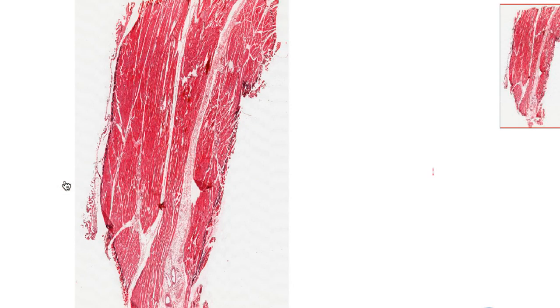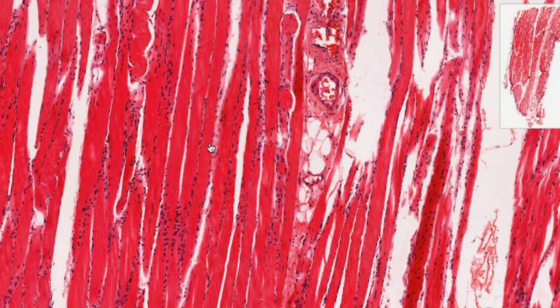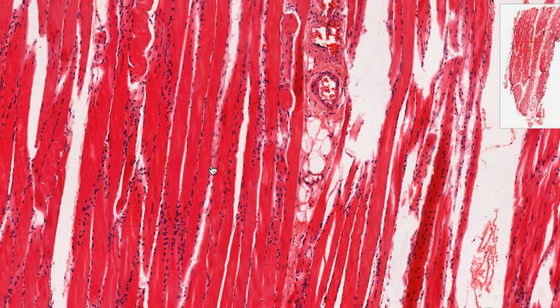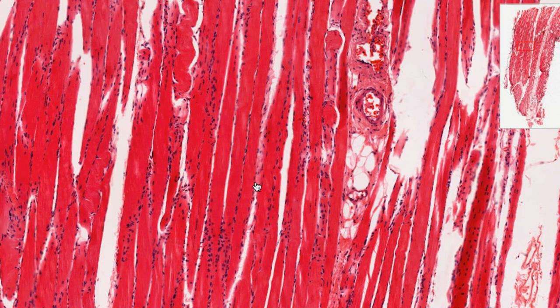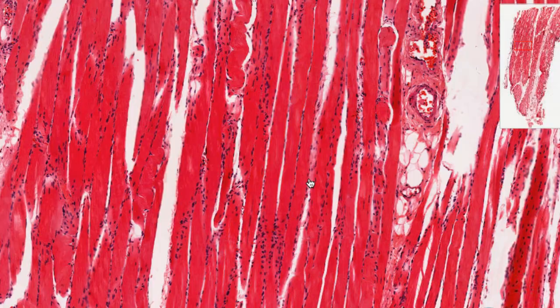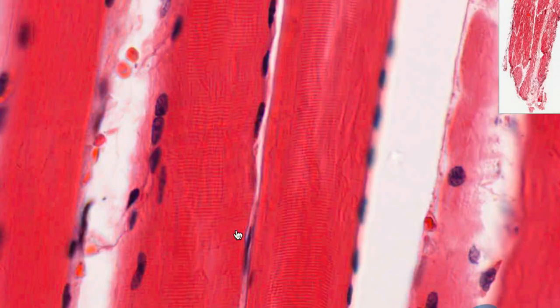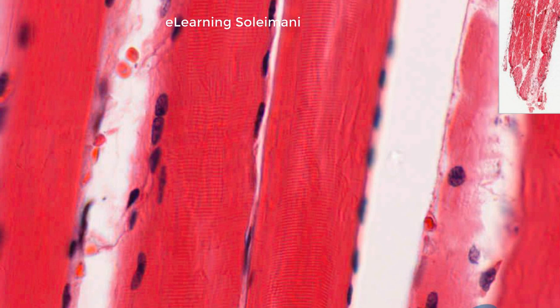The next slide shows skeletal muscle. Look at the individual muscle fibers within the tissue; these fibers appear elongated and cylindrical in shape. Observe the striations caused by the arrangement of the sarcomeres within each fiber.